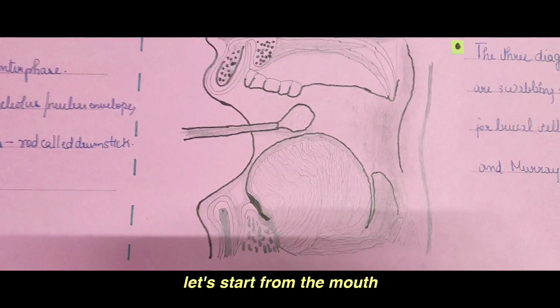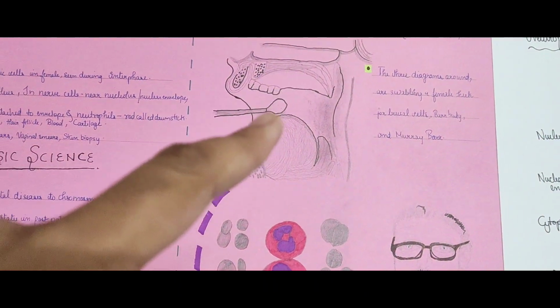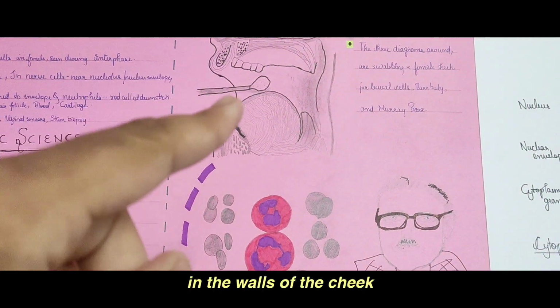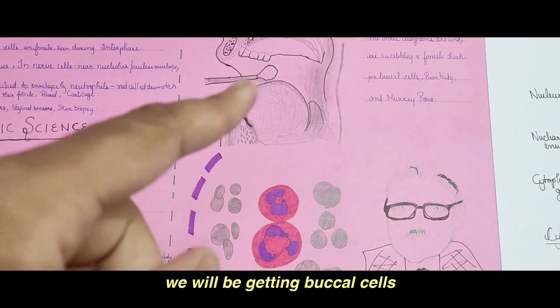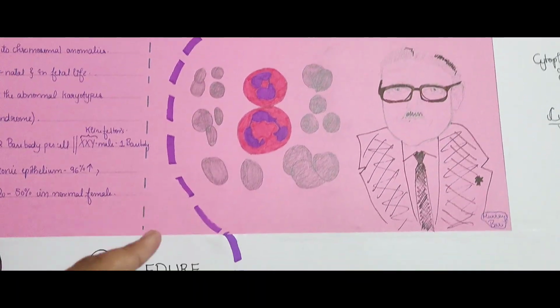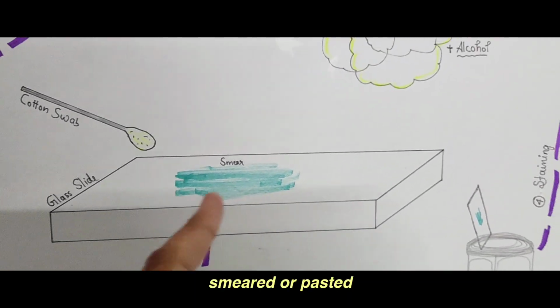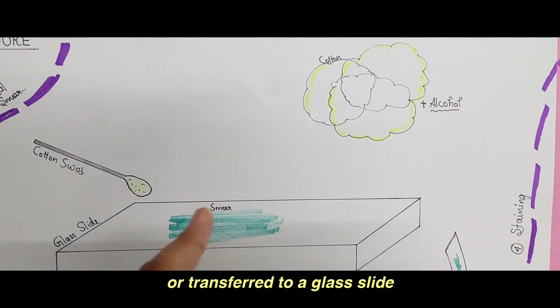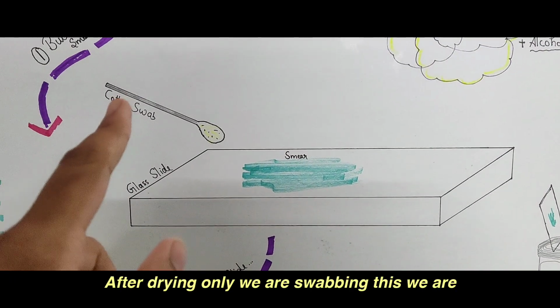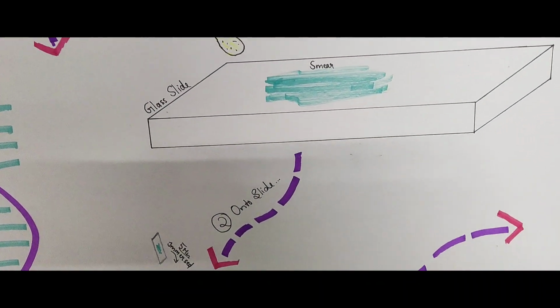For the procedure, let's start from the mouth. From the mouth, in the female mouth or the male mouth, but let's consider the female mouth. In the walls of the cheek we'll be getting buccal cells. Using a cotton swab we will be collecting those buccal cells, and this smear is smeared or transferred to a glass slide which is cleaned using alcohol and cotton.